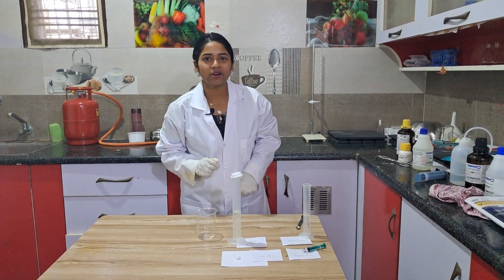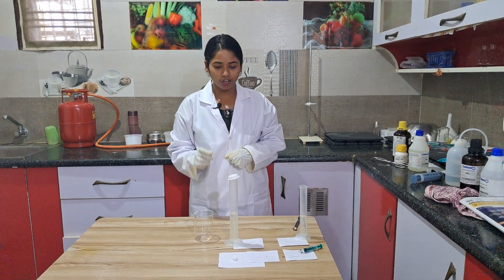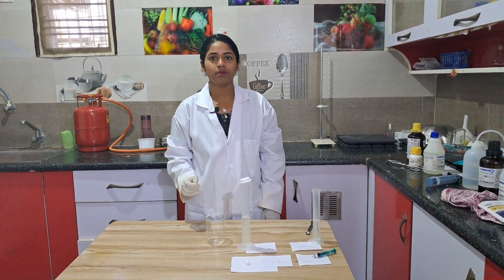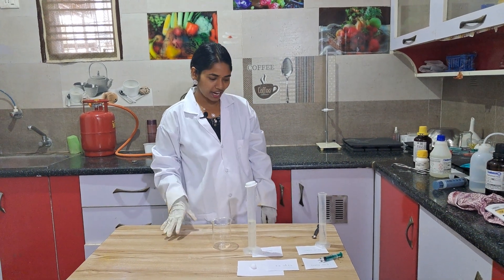Hi students, I am your Komali ma'am. Today I am going to do it and show you the preparation of iodiform. Let us see how to prepare iodiform.